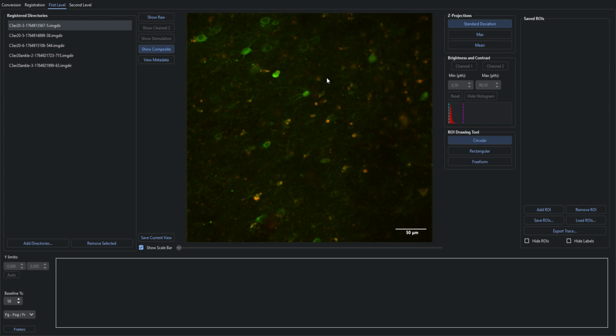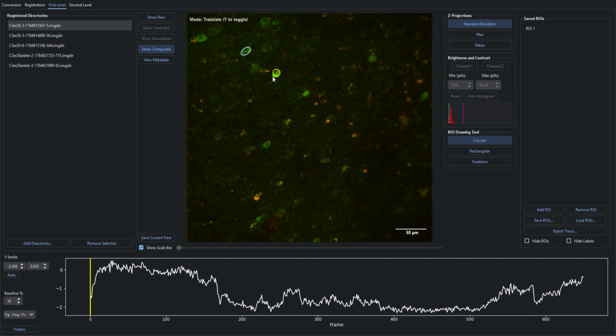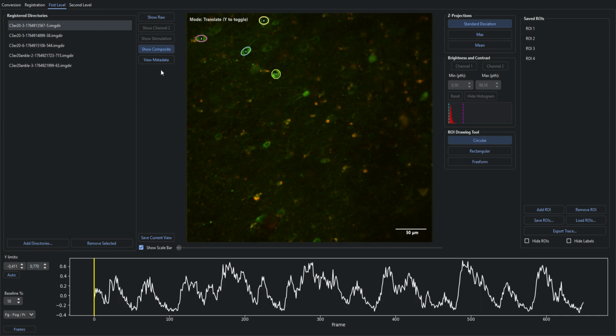All right, and now let me show a brief demonstration on how my workflow would be. So for example, I'm on this sample. I will circle this, right? I can move it along, and then I can press Y and then drag it to make sure it fits. Y again to translate it. Press R, and then for this one, and then what else? This one, and then this one, and then just keep doing it for all of them, right?